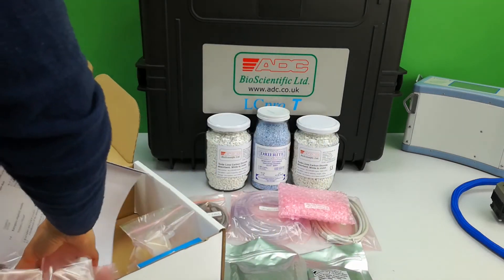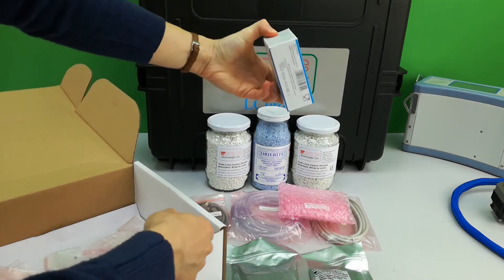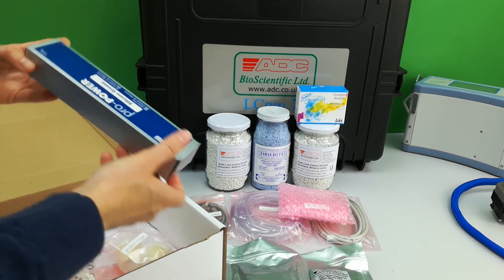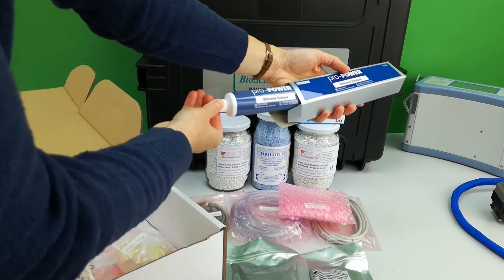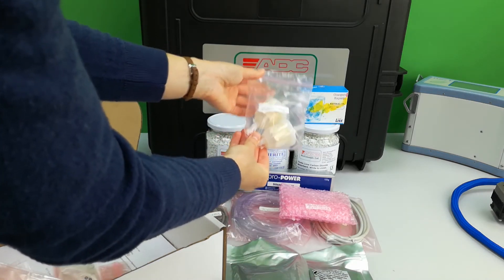A set of 10 CO2 bulbs or cylinders are supplied for CO2 control within the chamber. A tube of silicon grease is provided to maintain all seals and moving parts over time.